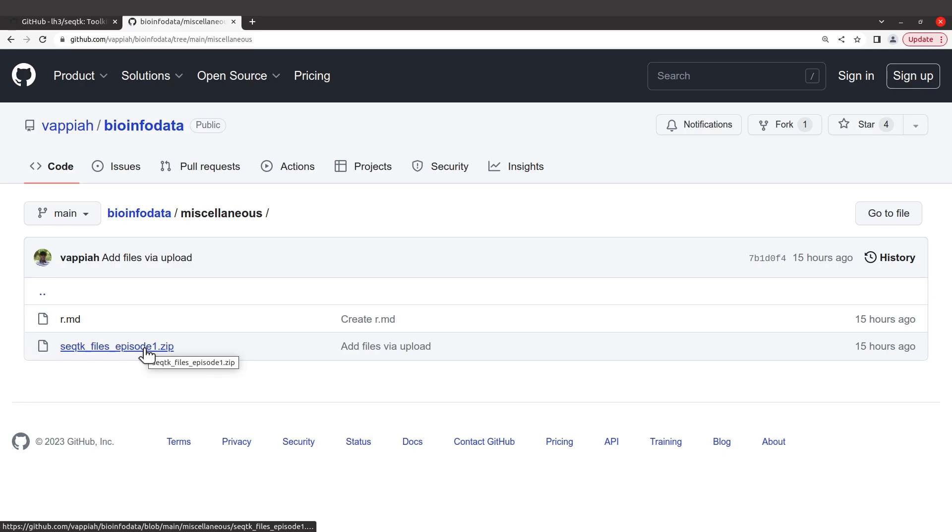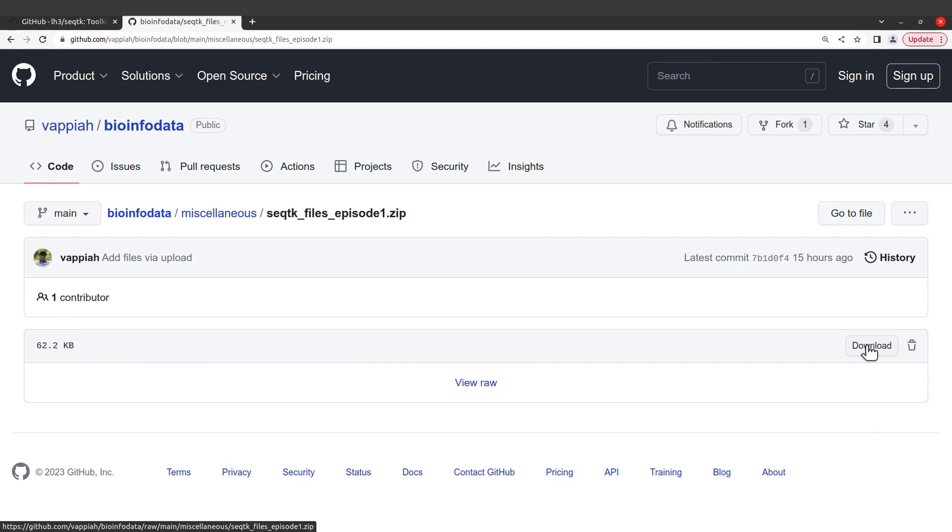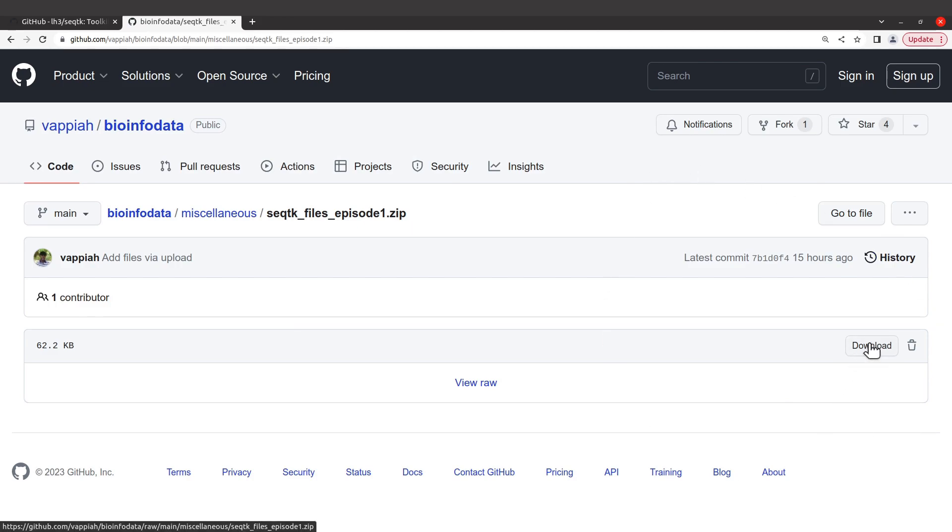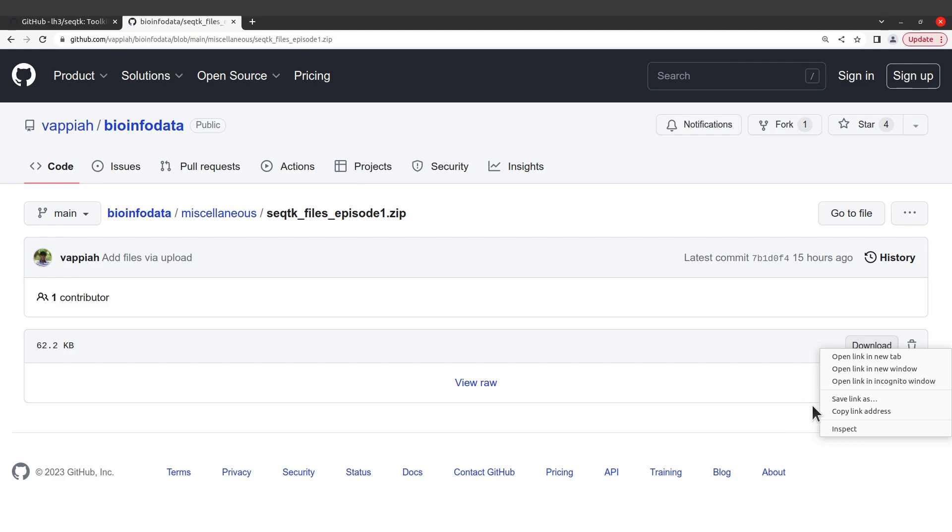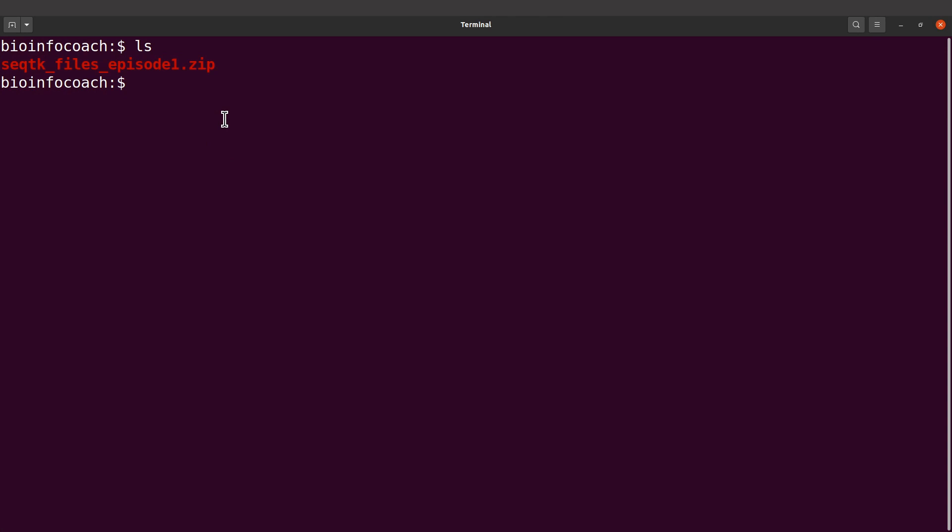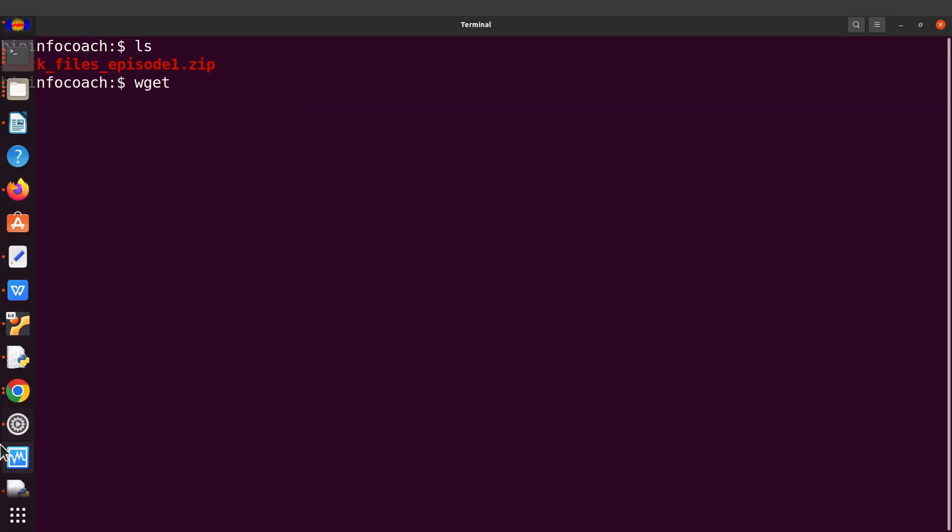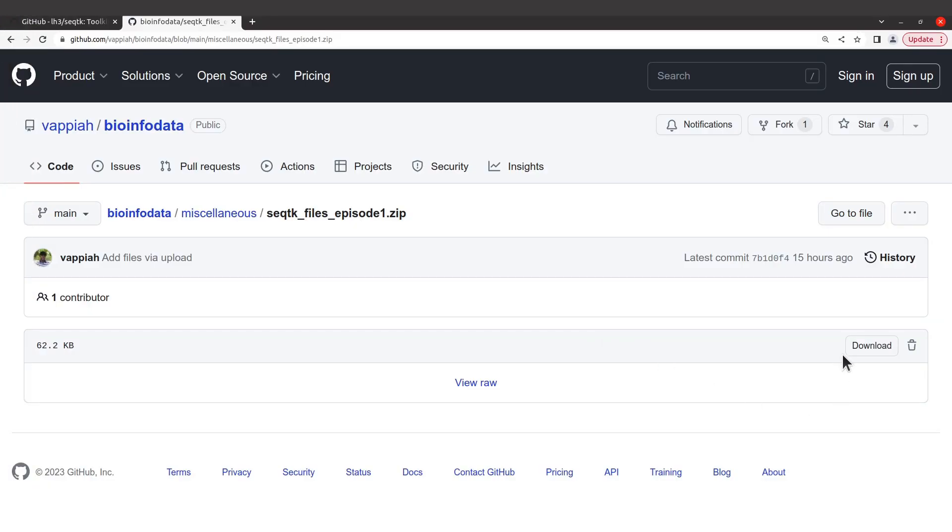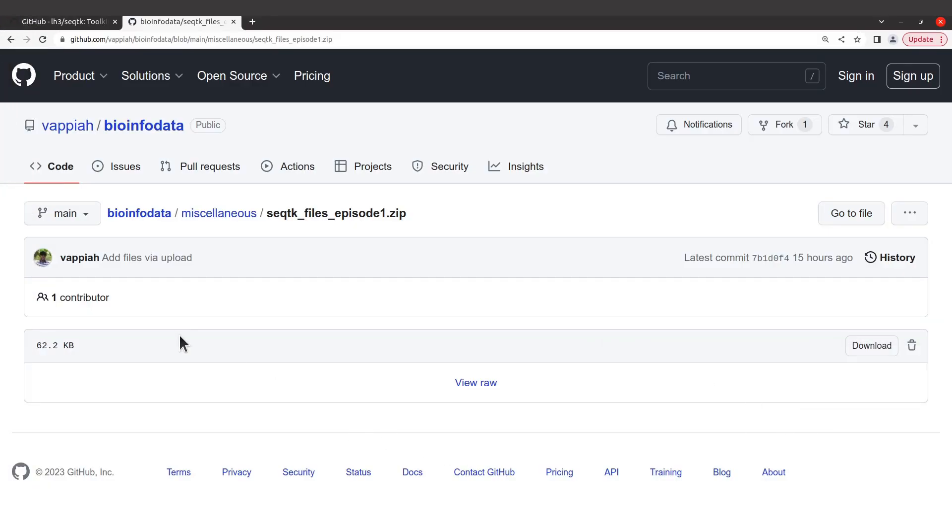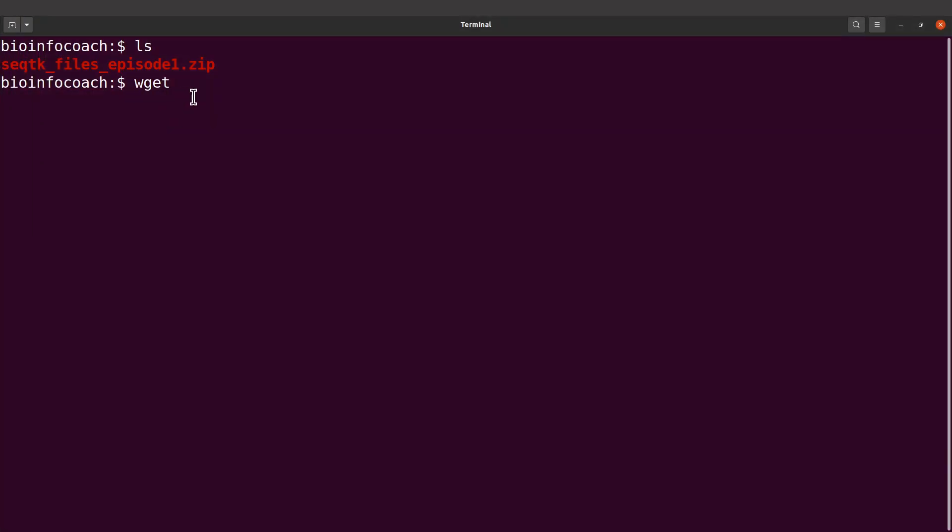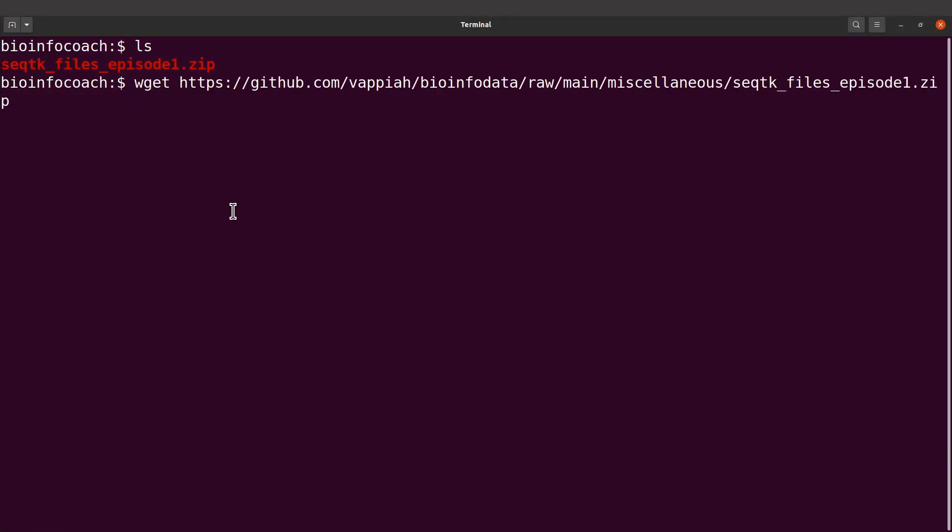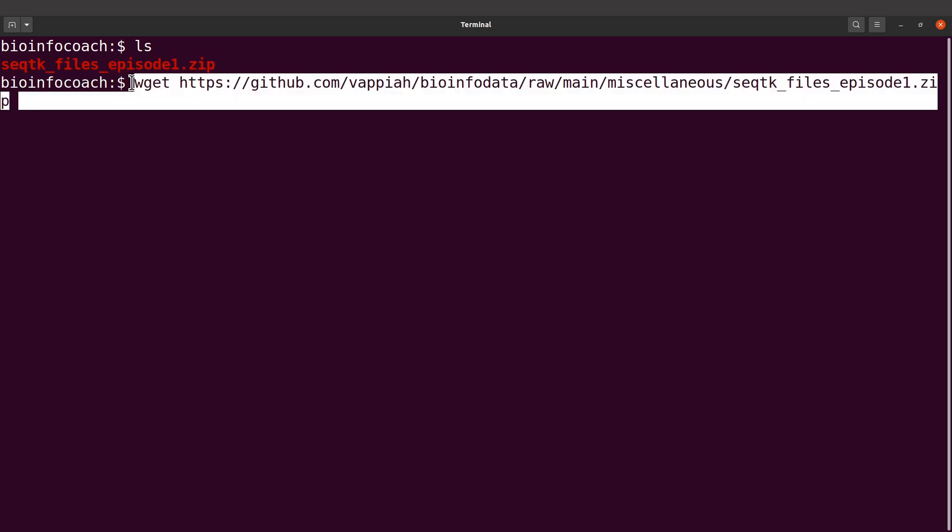Alternatively, you can right click and go to copy link address. Then when you come to the terminal, you can use wget and then you supply it with the link. Just copy the link address, then type wget and then paste it there. This will download it for you. You can also use curl to download.